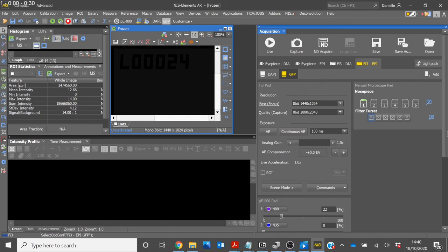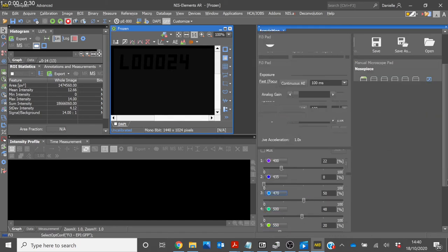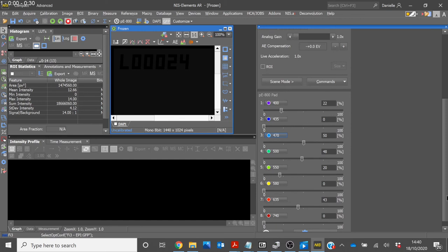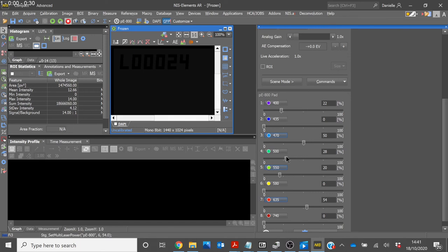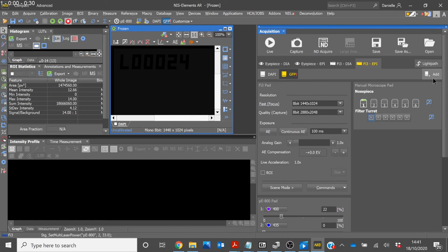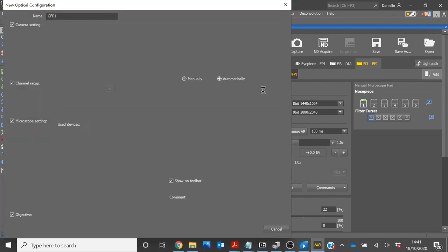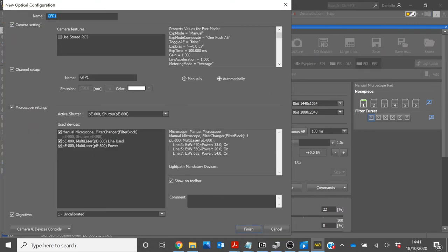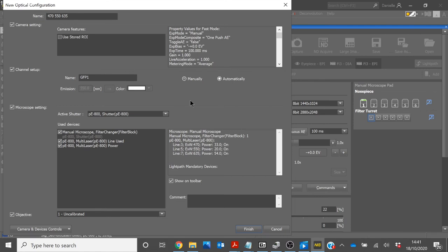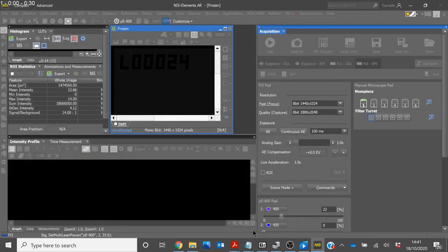It is also possible to have more than one LED illuminating in one configuration. For this example we will have 470, 550 and 635. Adjust the intensities and then click Add. You will see that the 3 LEDs have been added with the appropriate powers. Again, name your settings. Ensure that the correct shutter is selected. And select Finish.